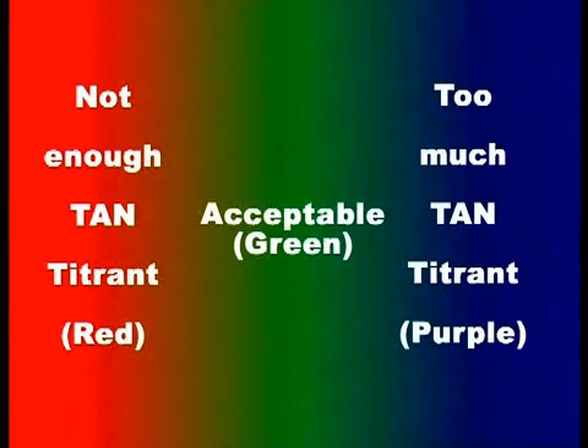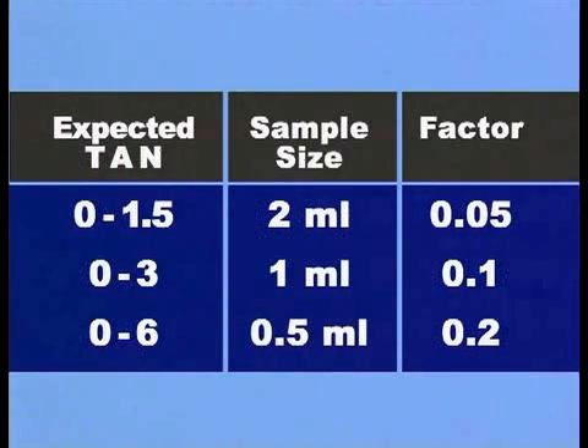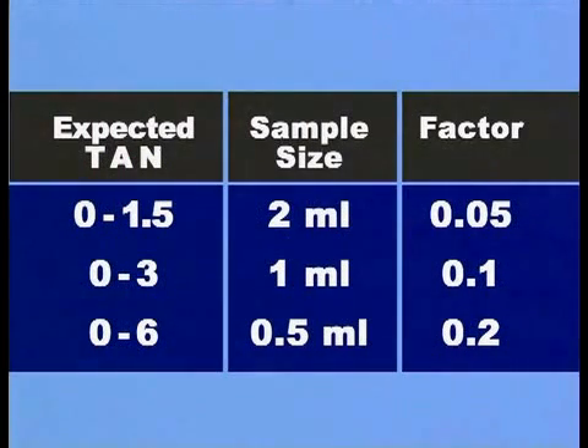Refer to your colour chart to check the reagent colour. Refer to the table to ascertain the correct size of your oil sample. If the expected TAN is unknown, use one millilitre of oil sample.